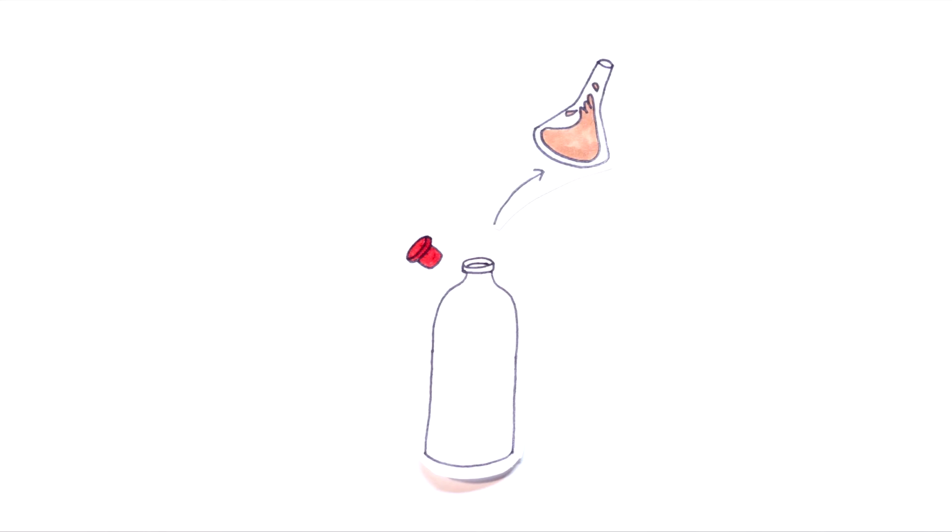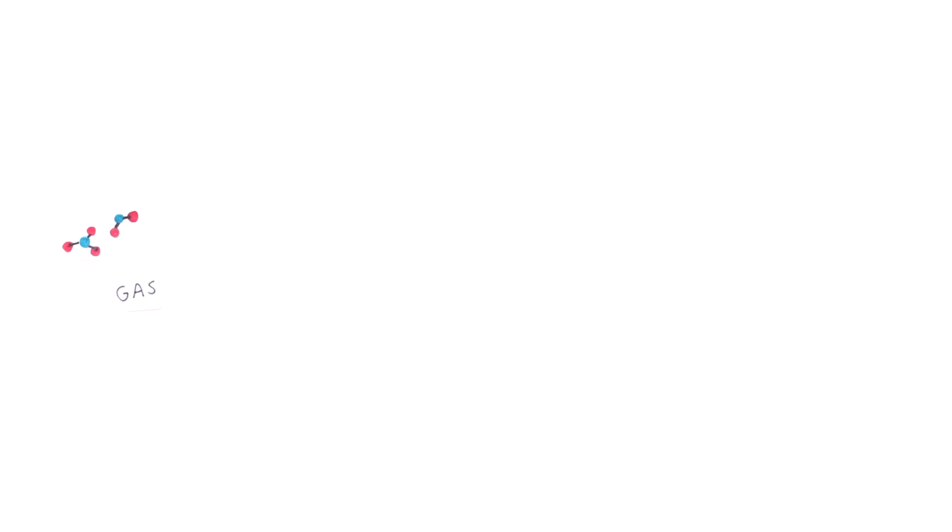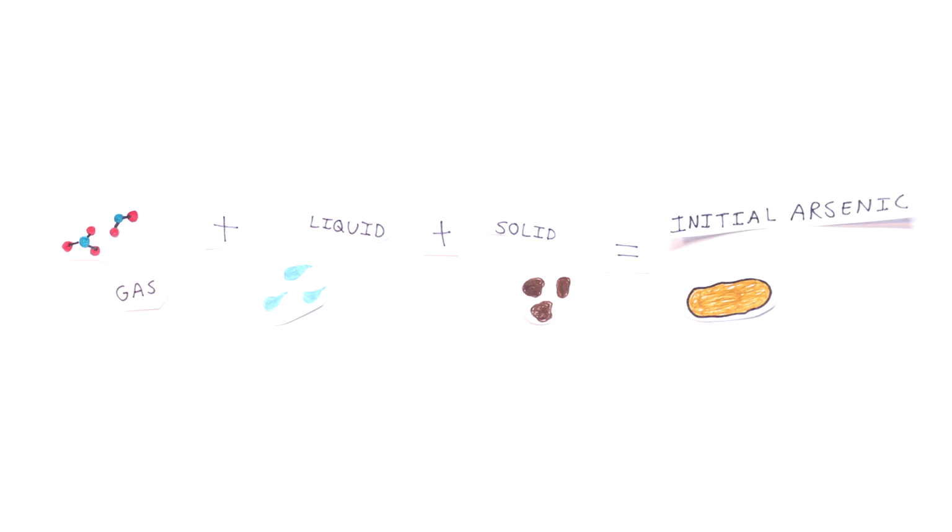After around 17.5 days, the reactors were shut down, the contents were centrifuged, and the liquid and solid phases processed and quantified for any arsenic using the inductively coupled plasma mass spectrometer, ICP-MS, which is a machine that allows us to quantify low concentrations of various metals. This way, we were able to keep a mass balance and account for almost all the arsenic starting up as ECAR waste in our system.